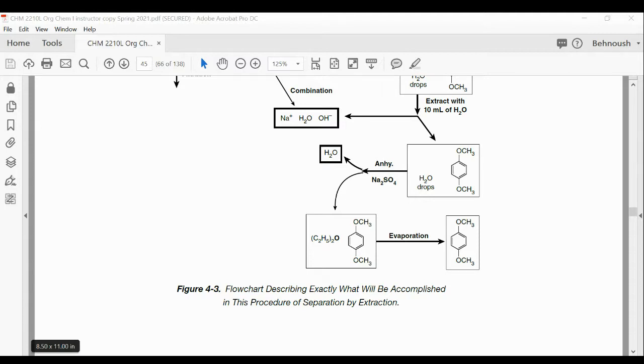If your reagent, which is sodium hydroxide, is the limiting reactant, it will finish, and then you would have more benzoic acid left over in this case and in general. Yes, that is true. So for consecutive extraction, you have to pay attention to the milliliters of the solvent that you are using as well.